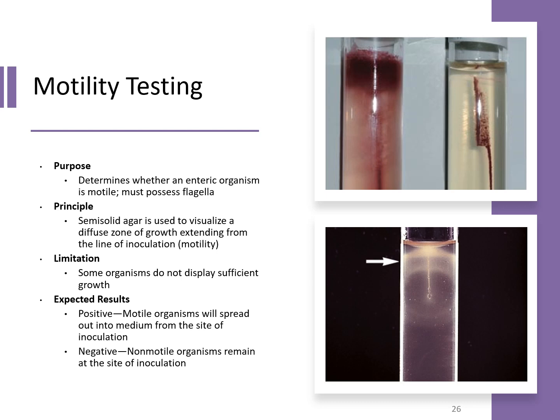So with that agar, we would take that culture onto a needle, which is basically a piece of straight metal. And then we stab that down into that agar. And you can see here where that organism has grown all along that stab.